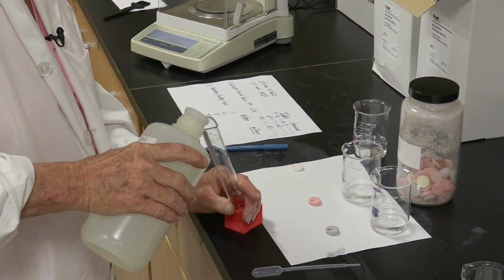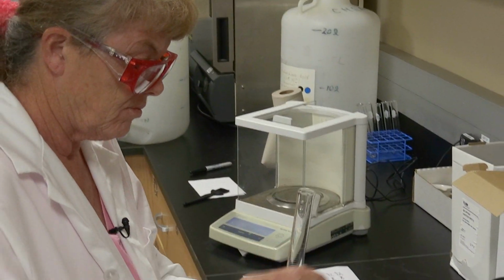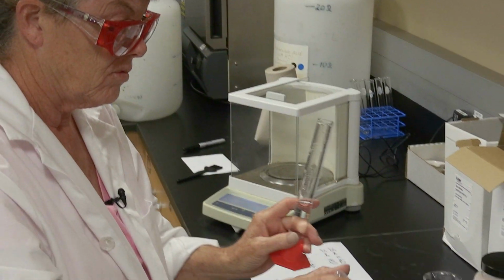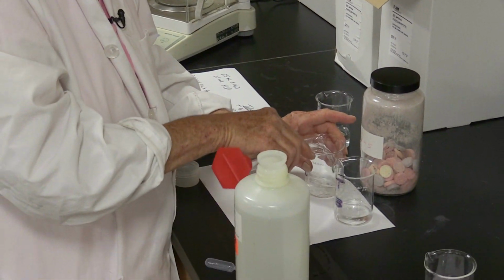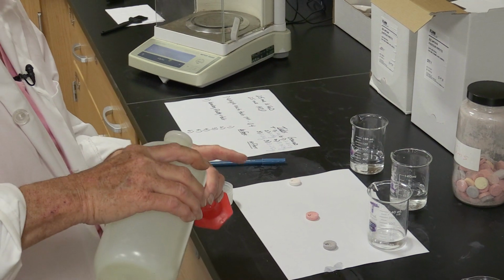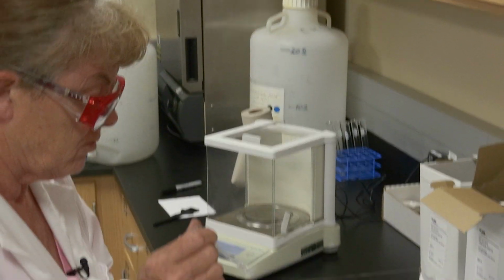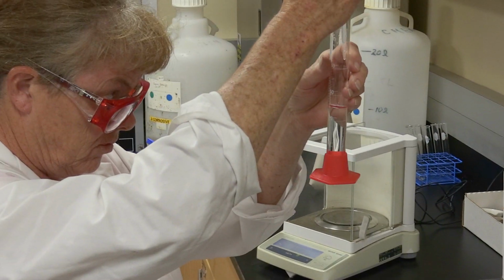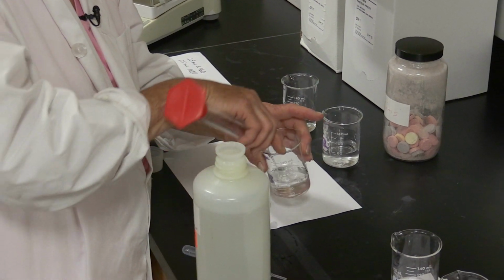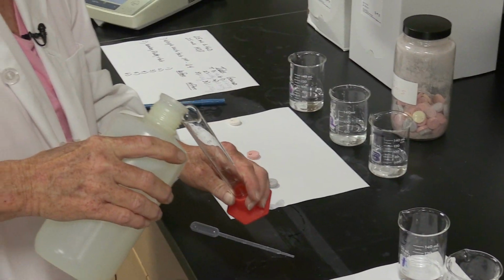Put it back. Do the same with the generic, 25 mils of acid to each beaker.